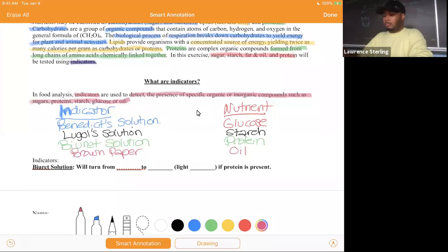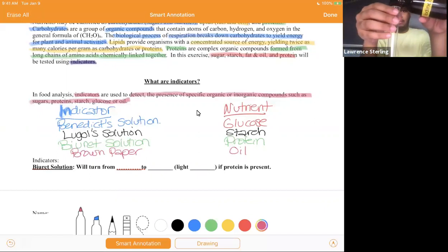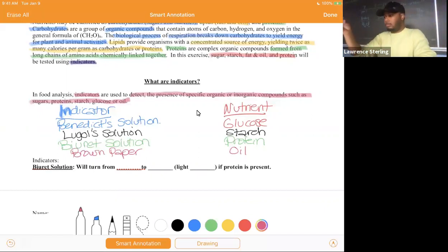Next, we have our iodine. We're just gonna put just enough iodine to see inside of another clean test tube. And as you can see, it's like this really pretty brown color. That color that we call that is amber, A-M-B-E-R, amber, all right? Now we're gonna see what happens. We're gonna shake it up again.